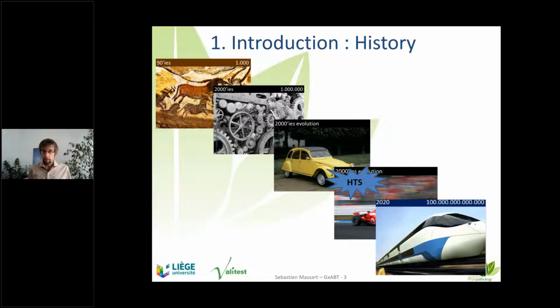And today, or last year in fact, a few months ago, we were able to look at this. It's about 100,000 billion bases a day that we are able to sequence. That's a huge difference. We started from 1,000 per day and went to 100,000 billion a day. No other technology has come so fast in this time frame, with a clear exponential acceleration in the last decade. So it raised interest in the diagnostic of plant pests, whatever they are.